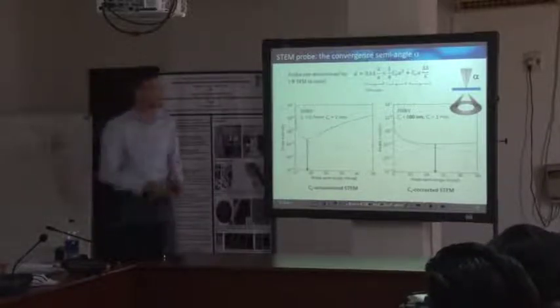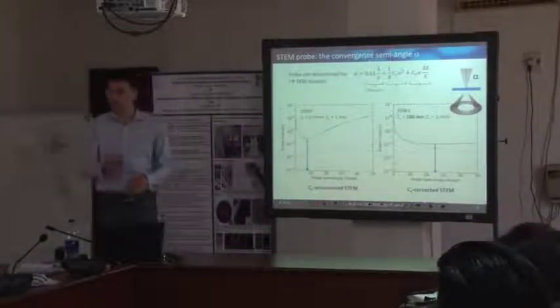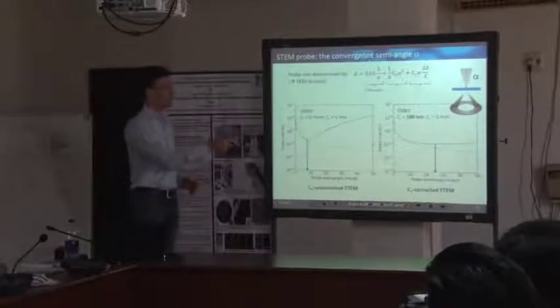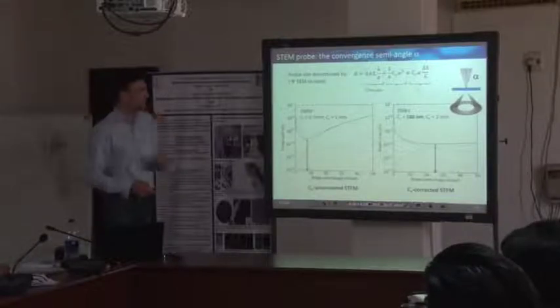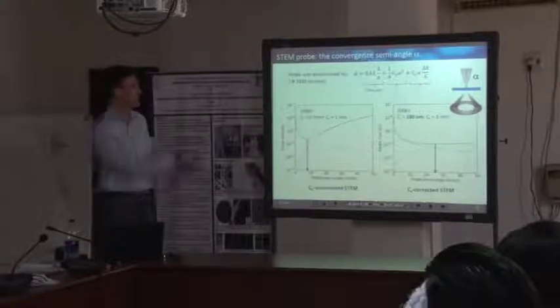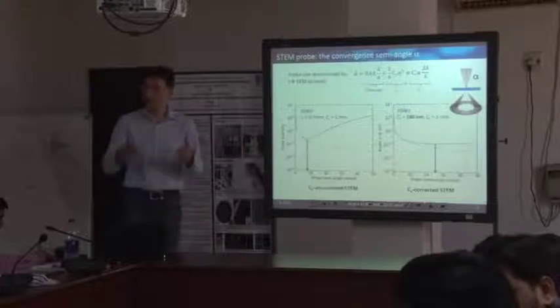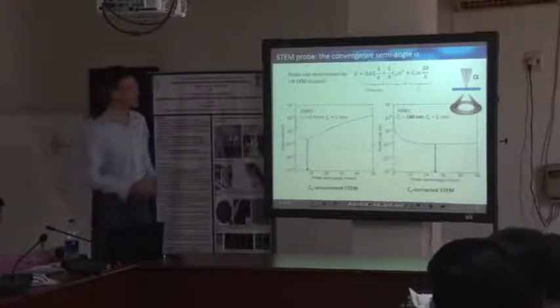In the scanning electron microscope, we had to deal with the chromatic aberration, because at lower landing energies, that clearly caused the broadening of our beam. This formula was already presented in the SEM lecture. But this is in principle the same for the transmission electron microscope. We have our spherical aberration, we have our chromatic aberration. E is far larger, delta E for, let's say, a Schottky emitter is the same.